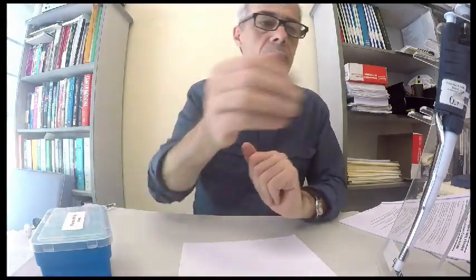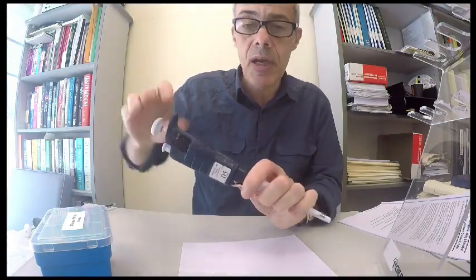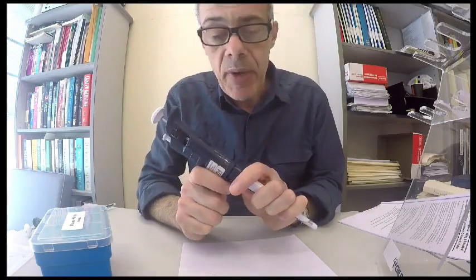Let's just quickly repeat that procedure with the P1000. Say I want to pipette something greater than 180 microliters, because I would use the P200 for 180. Let's assume 500 microliters, half a milliliter. Okay.